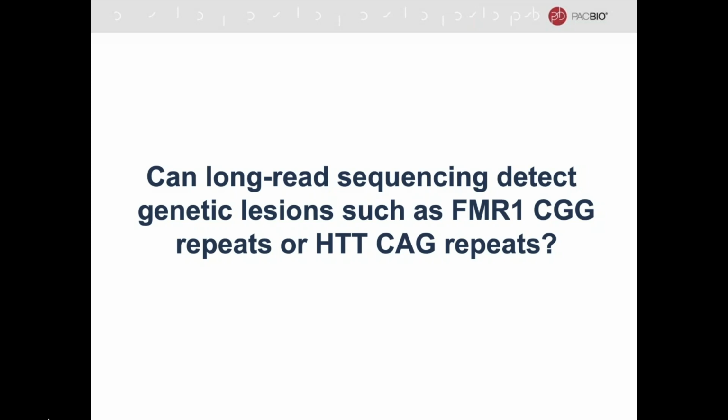And Olga definitely has comments. Yes, I have one comment, completely with you on that. One thing is the beauty of long-read sequencing is that not just you can read through those low complexity regions, homopolymers, you can also decipher the epigenetic signature in them. So in case you want to look at the base modifications, how they bind, how the complexity is, how they're regulated, that's actually an amazing thing. So for the first time we can actually start to observe how the epigenome is working in those regions.